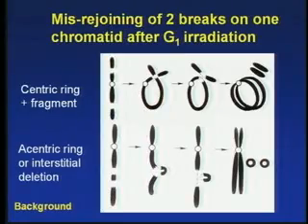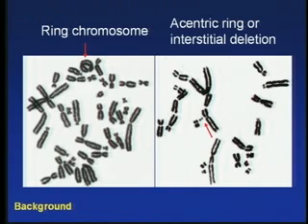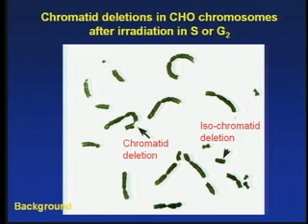This type of ring structure is commonly observed as micronuclei, which we're going to discuss next time when we do the lab rotations. This is one of the most common ways to form micronuclei. And that's why this kind of ring is called the acentric ring. Again, we can look at an actual example. You have the ring here with the centromere, and there you have a normal looking chromosome pair with a centromere, but indeed part of the chromosome is lost to form these two rings, or you can call them micronuclei.